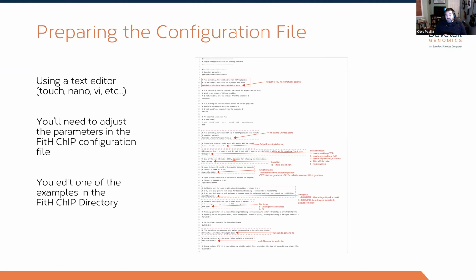Then the next thing you want to consider is what is the distance that you expect things to interact with, which is the next flag here that we need to adjust. So the lower distance threshold, meaning I want to look at all interactions that are greater than X distance, is going to depend on the protein that you've pulled down on. Here, their default is 20 KB, which is quite long. And if you're thinking about something like CTCF, that makes a lot of sense actually to put a cutoff at that distance because you expect longer interactions.